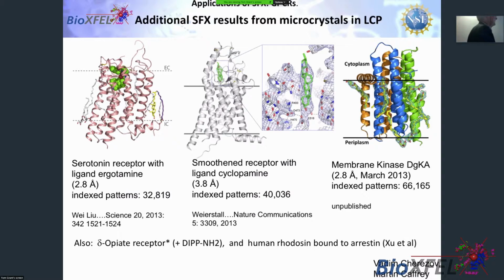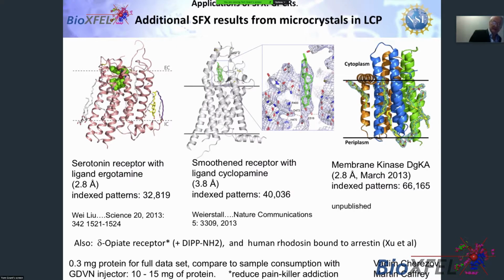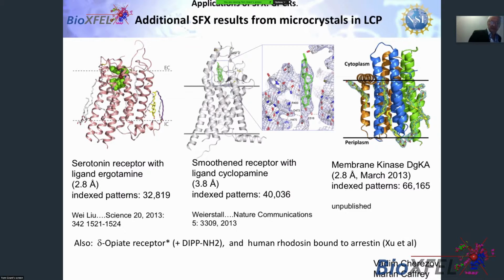And we have a paper, which I really don't have much time for, which in fact got us the most publicity in the last year, from Eric Xu, on human rhodopsin, the sensor of the pigment at the back of your eye responding to light. And we have other work by that on with Marius, which I'll mention.